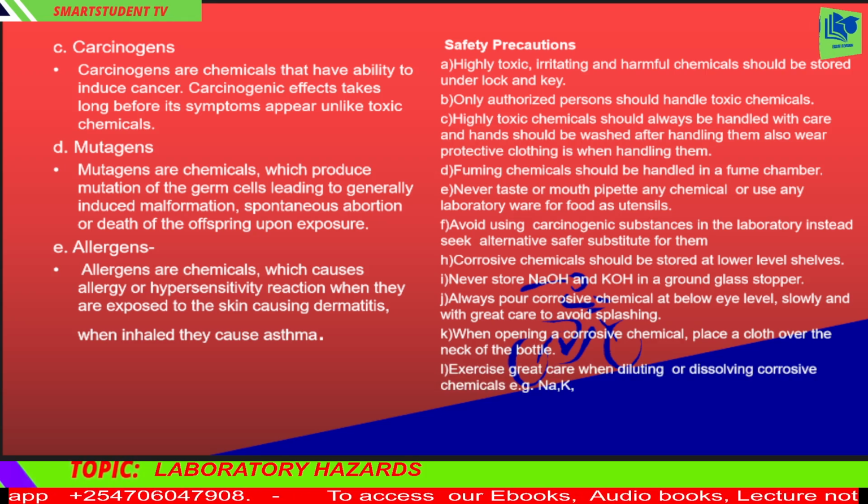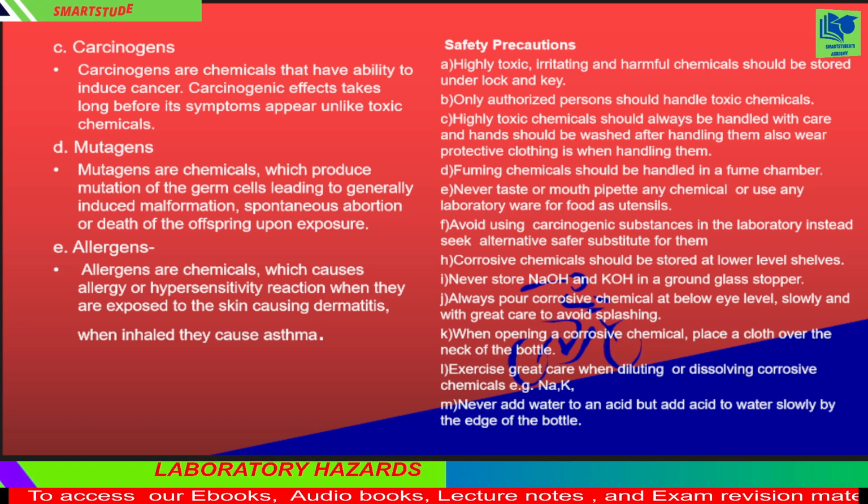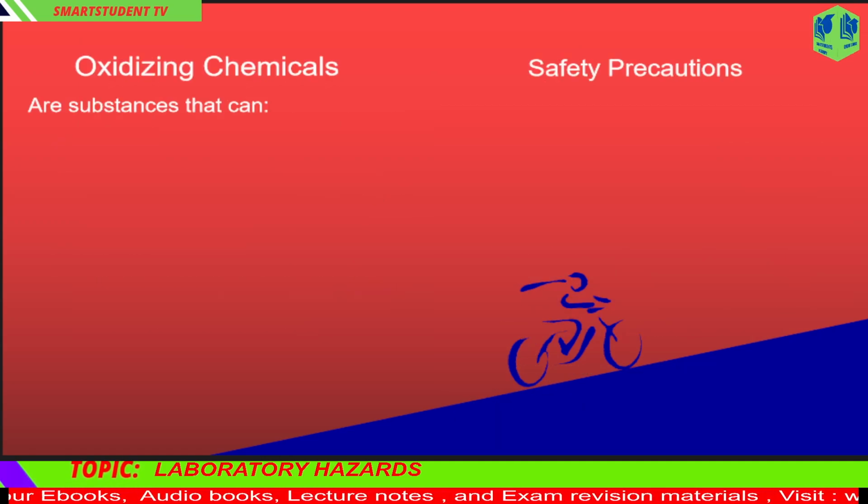L. Exercise great care when diluting or dissolving corrosive chemicals, e.g. sodium and potassium. M. Never add water to an acid, but add acid to water slowly by the edge of the bottle.